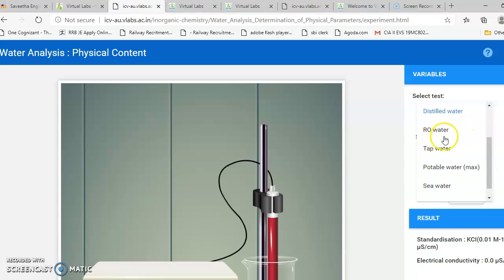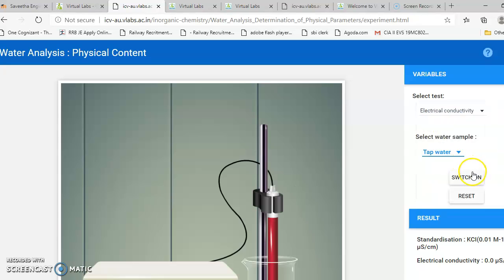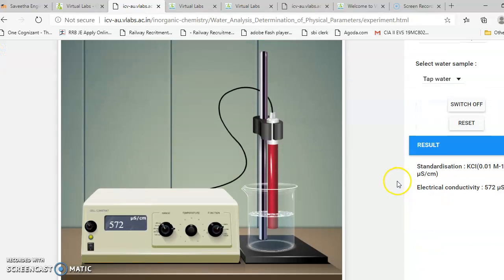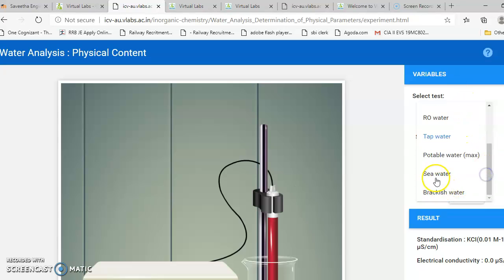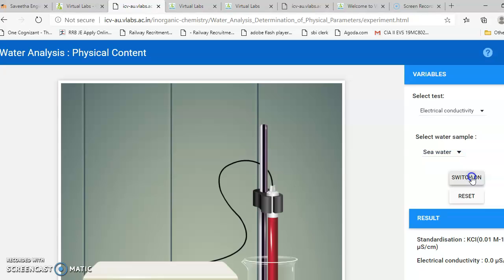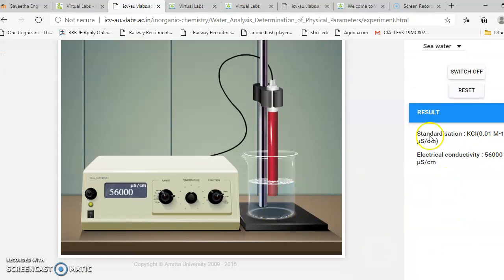You can similarly measure RO water and river water. For seawater, switch on the instrument and you can see 56,000 micro siemens per centimeter.